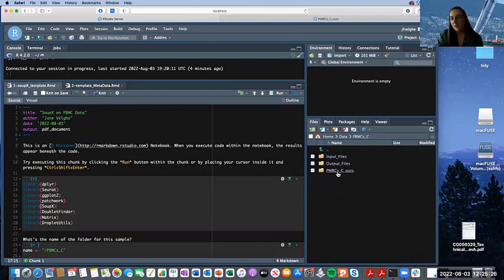Again, this is the data from the 10x chip that was loaded onto our Chromium controller machine, which is a device. This machine basically takes in this microfluidic chip and partitions the cells, the gel beads, and the partitioning oil into those gems. So a bubble basically containing the gel beads with unique molecular identifiers to label the cell as well as the cell itself. So this is using the controller machine.